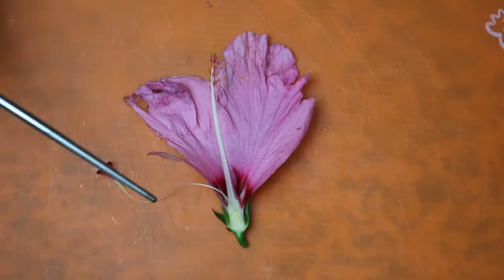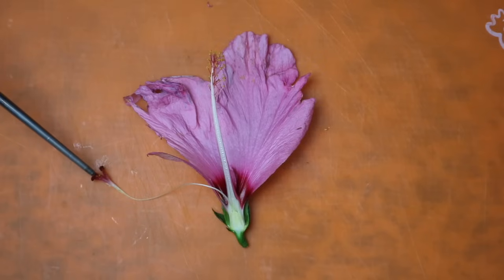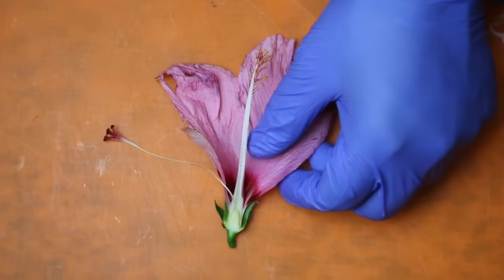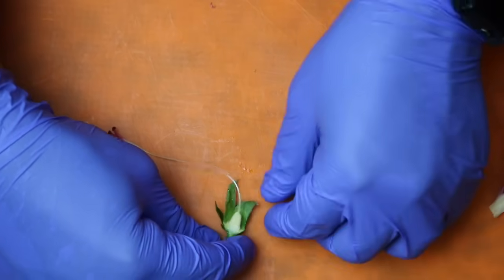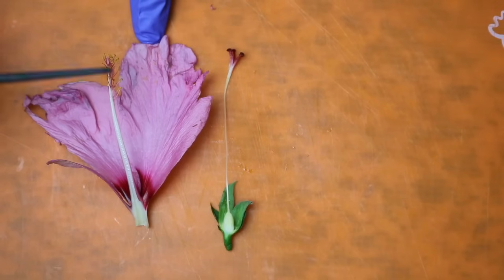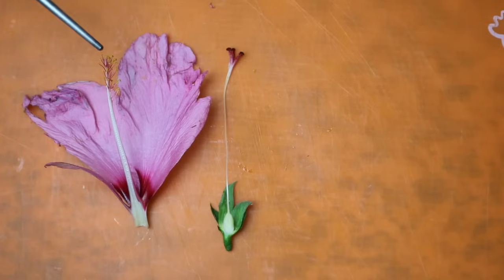Inside the ovary are the ovules, or the eggs. What happens is pollen comes — hopefully from another flower — lands on top of that stigma, and then travels all the way down to those seeds where they will be fertilized. Now that we have the stigma and the style disconnected, all we have to do is pull apart here and we have our female organs of the plant. And this here is the male organ of the plant — those are the filament, and on the end is the anther, that little yellow spot, which is what holds the pollen.